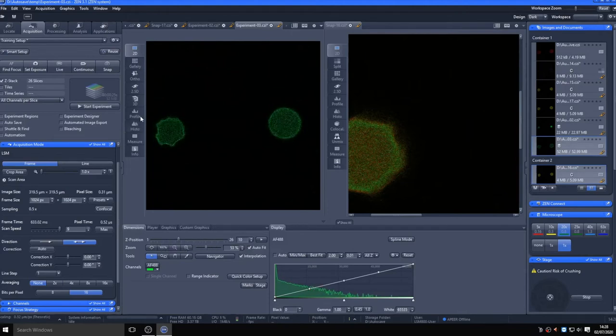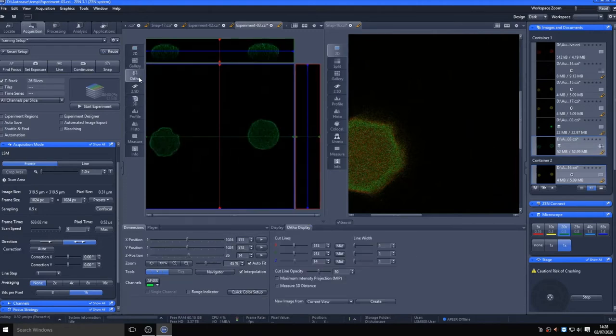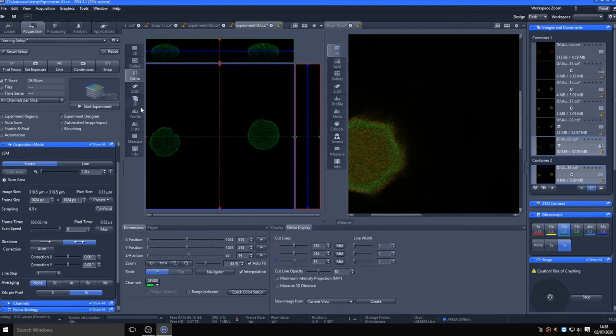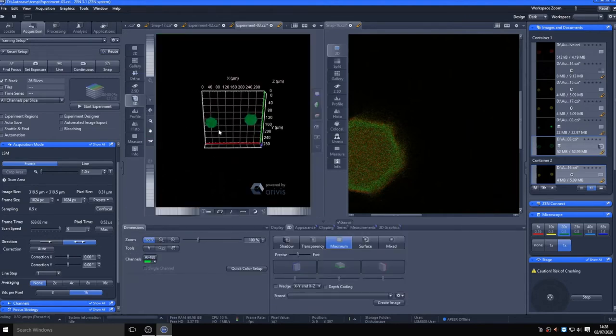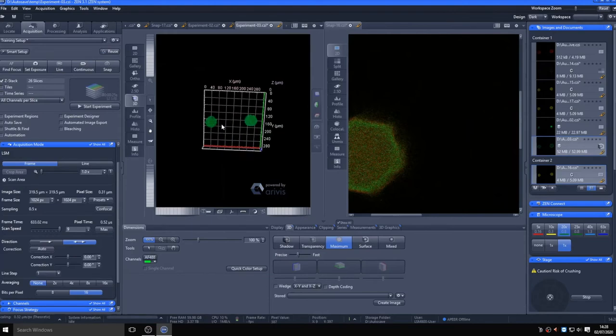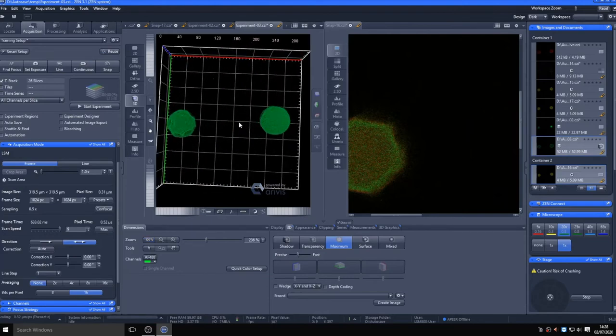It can be useful to switch back to one-container mode to give a larger view. As you can see, these aren't the best images, with some banding evident due to Z-undersampling, which is expected given we deliberately reduced our data sampling.